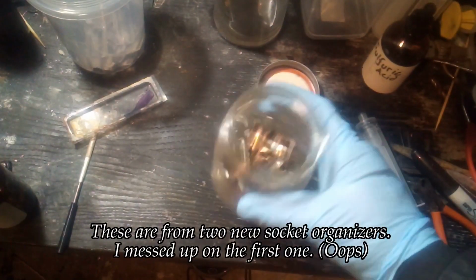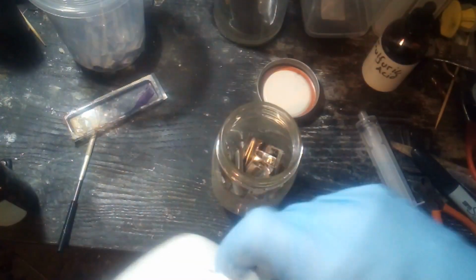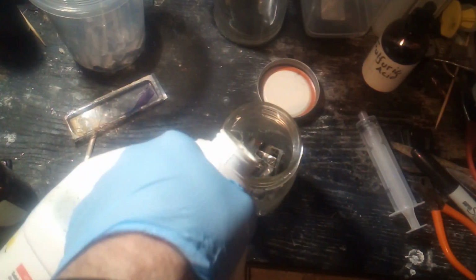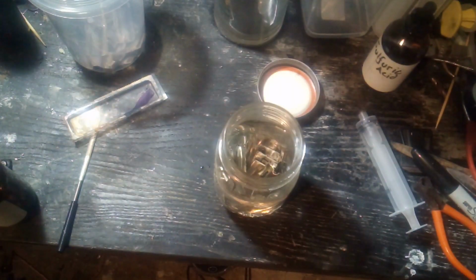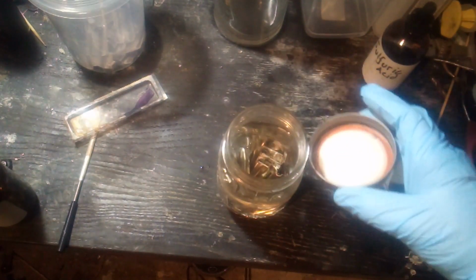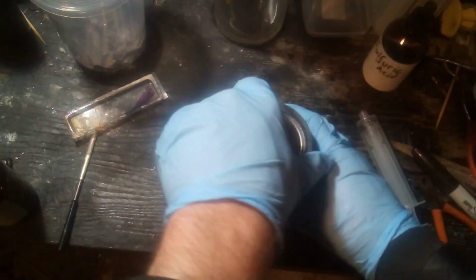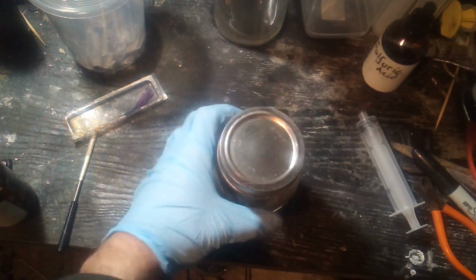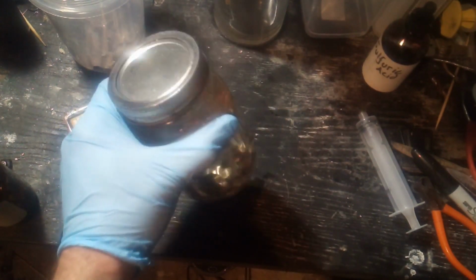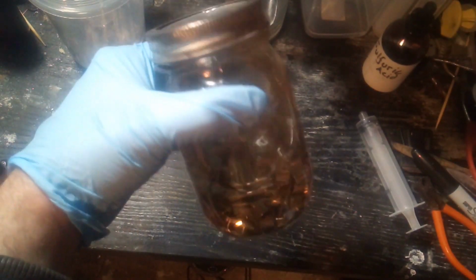One jar of assorted chromium plated pieces, and hydrochloric acid. The first time I tried this, I made a mistake and I added hydrogen peroxide to this to try to speed up the reaction. This apparently started eating the chromium in addition to the base metal. So this time around, this is just neat hydrochloric acid. And I'm going to let this sit here for a while and marinade, for lack of a better word.